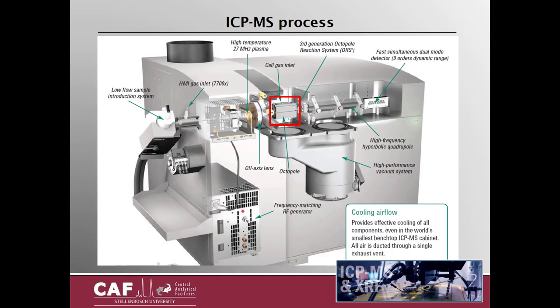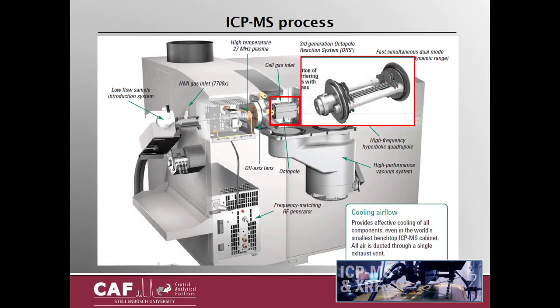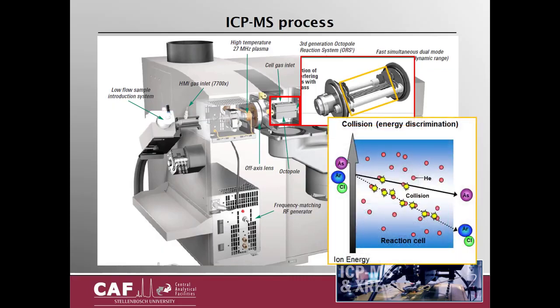So in order to remove interferences, ICP-MS has a small cell filled with helium through which all the ions pass before it goes any further. The principle of interference removal is that in a small space pressurized with helium, the larger interference molecules, argon chloride in this example, are 99.9% guaranteed to all collide with the helium molecule, which will slow them down, while the small analyte ions, namely arsenic in this example, will collide less with helium and have a higher velocity.